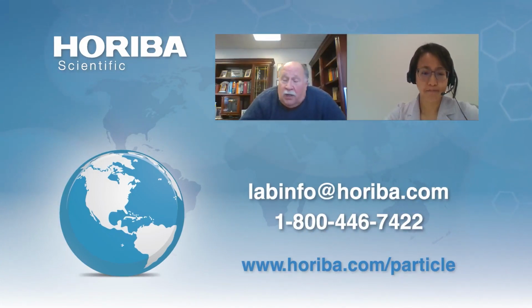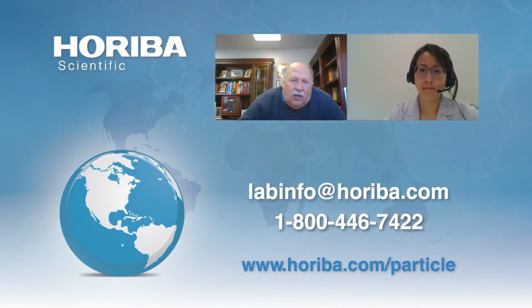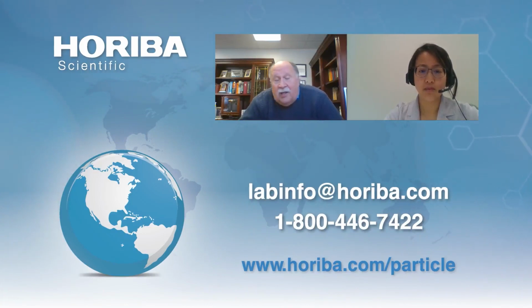That's always the challenge, because laser diffraction techniques typically assume a sphere, so they push everything into a sphere. The best people see with laser diffraction is a bimodal distribution, even though they might have just needles. Looking at the long end versus lengthways, you'll get two different particle sizes.